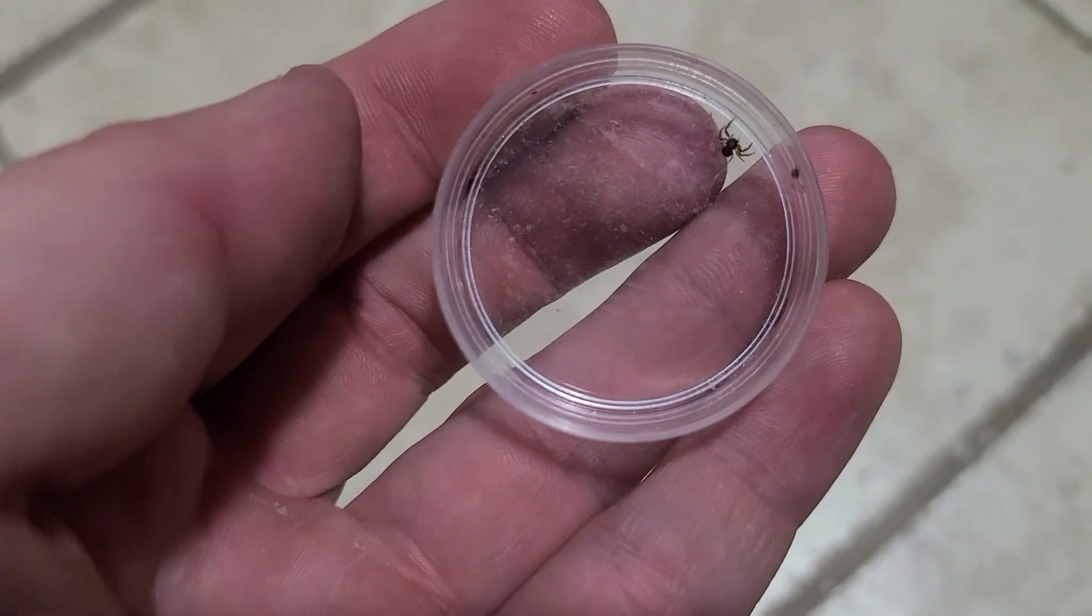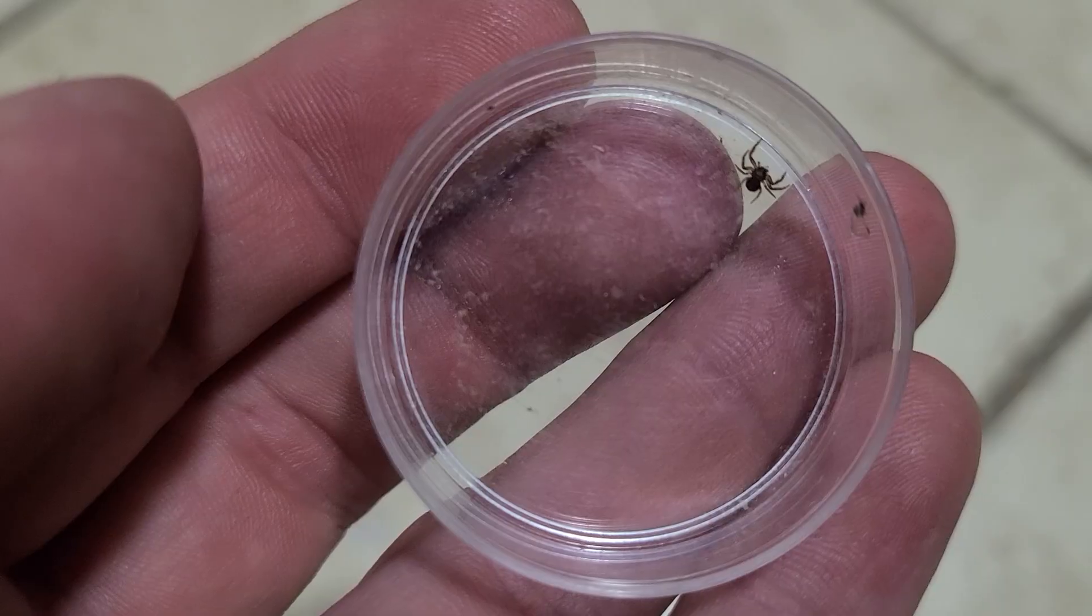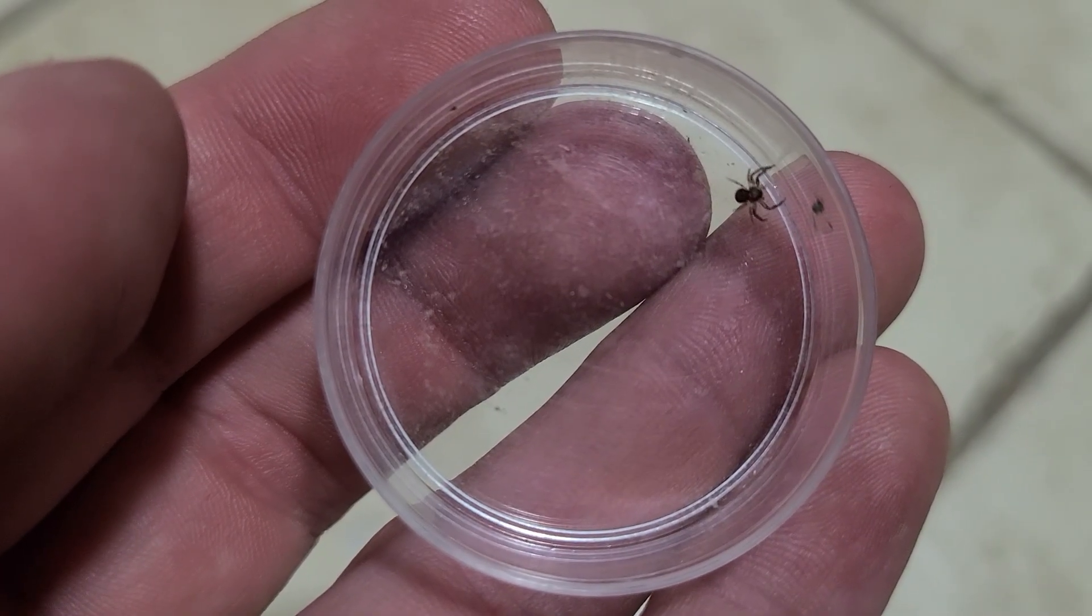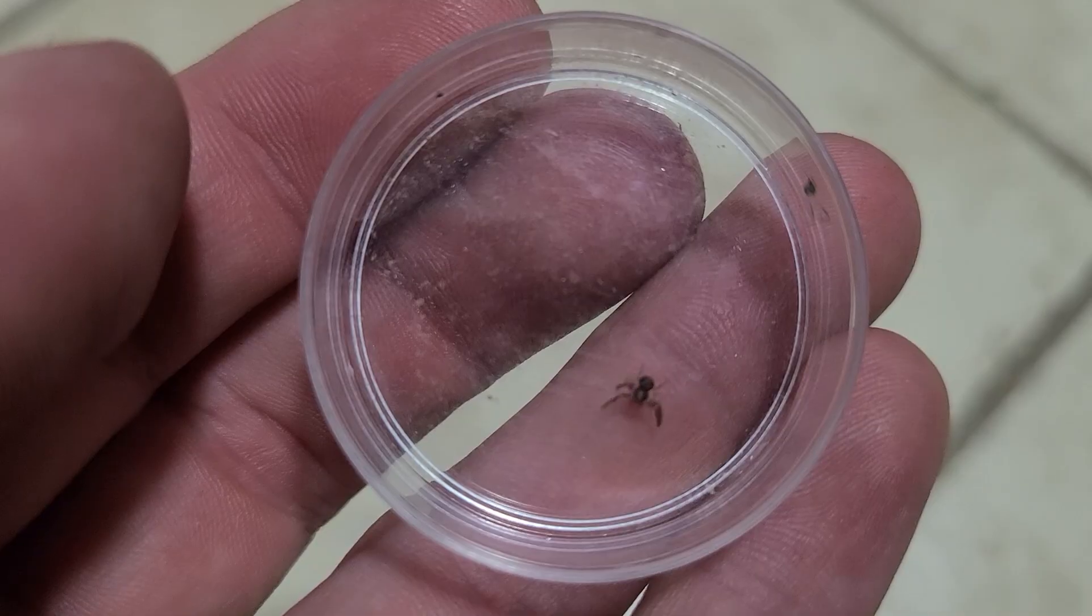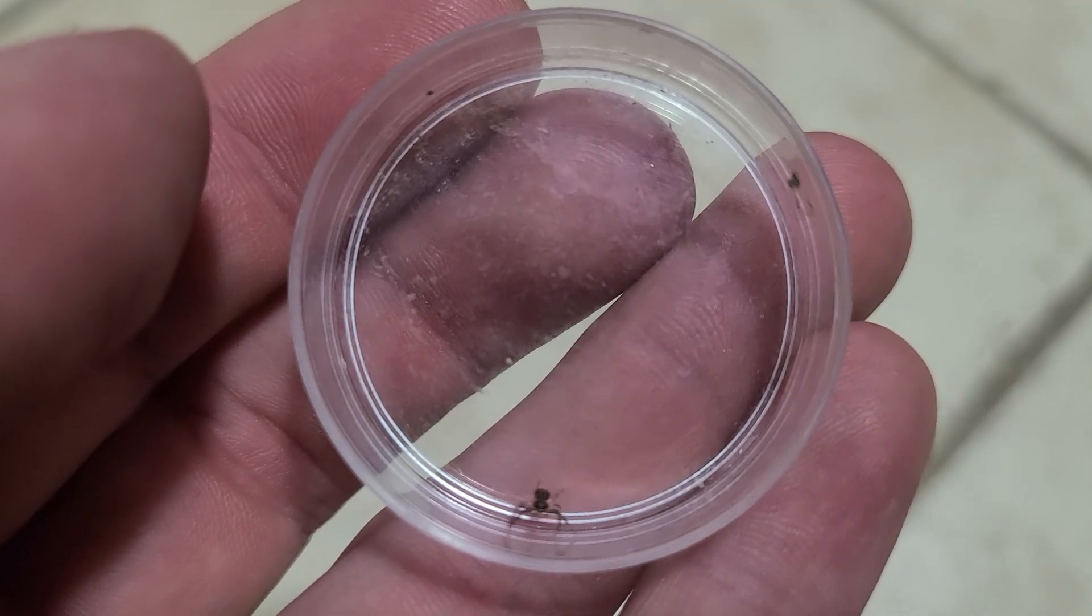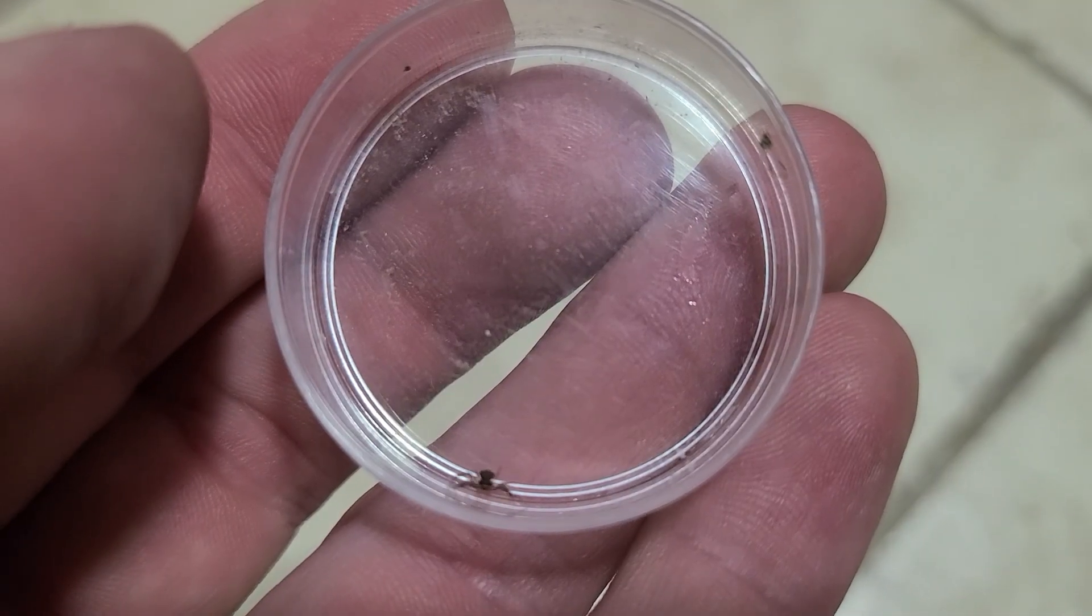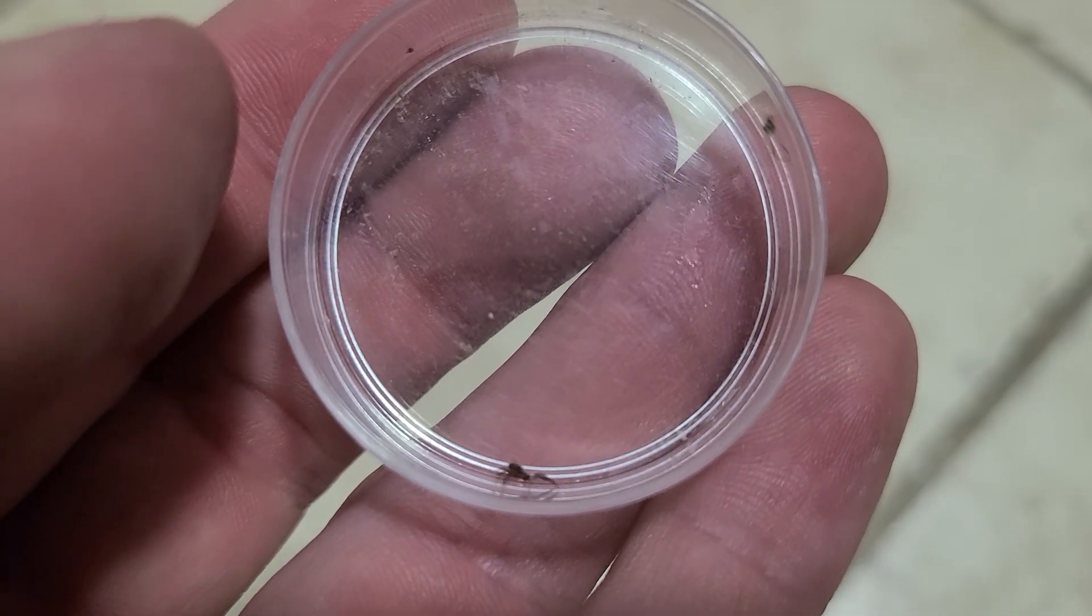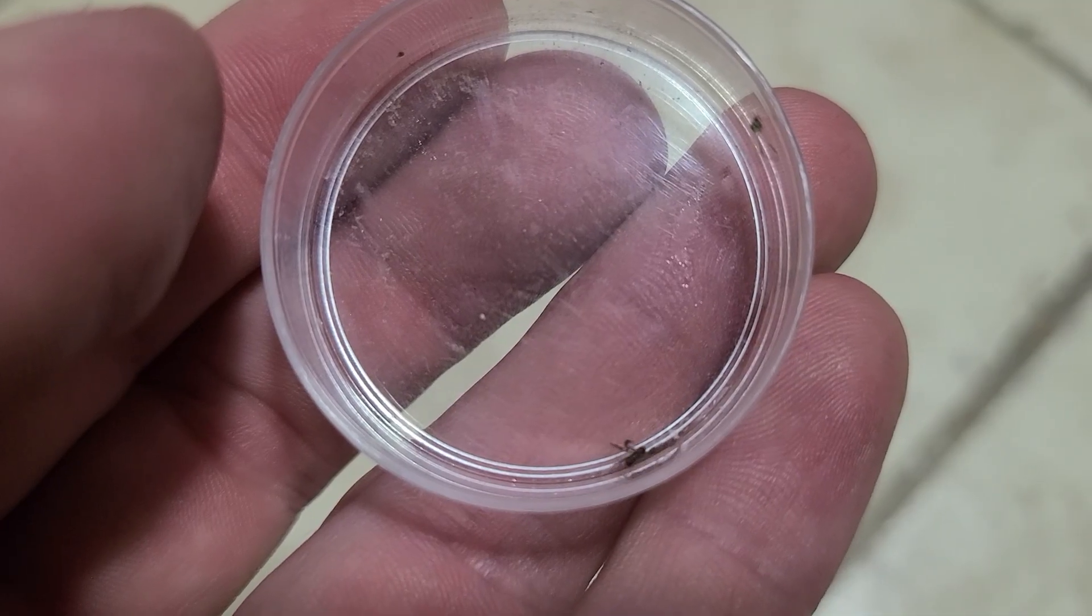Today we're going to be looking at a very unique spider. It's not a rare spider, but it is quite unique, and that is a crab spider. These guys are unique in the way that when you first see them, you'll see them walking sideways or backwards, which most spiders don't do, and that's what gives them the name of the crab spider.